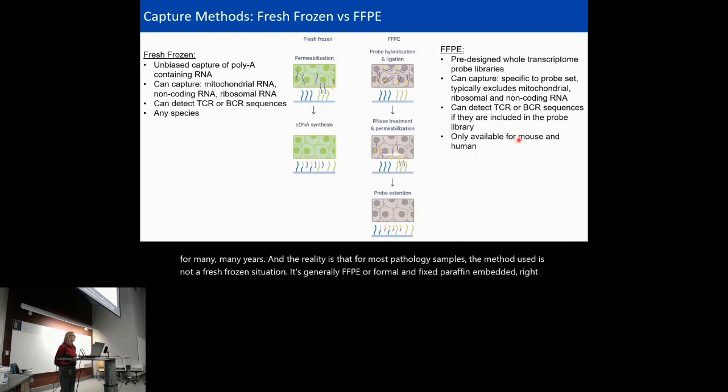So it became pretty clear pretty early on to these companies that they were going to need to create a system to capture FFPE. What I just described to you is essentially a fresh frozen workflow, where you have decent quality RNA in your sample that is going to float out during that permeabilization step and stick to those barcoded slides. So in order to get around the process of an FFPE, the main challenge being that FFPE really degrades RNA. That's like the first thing it does.